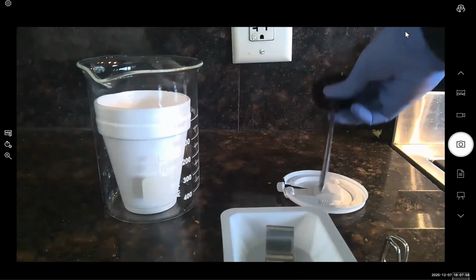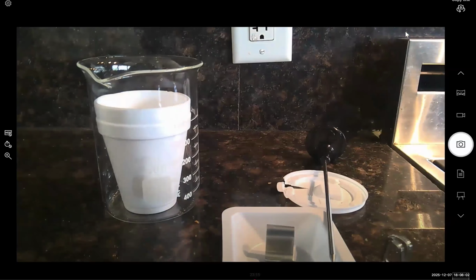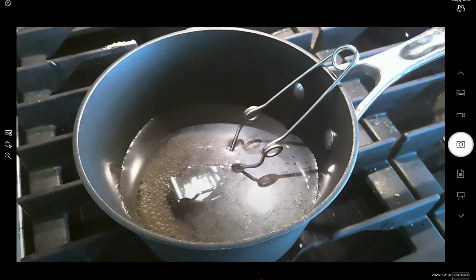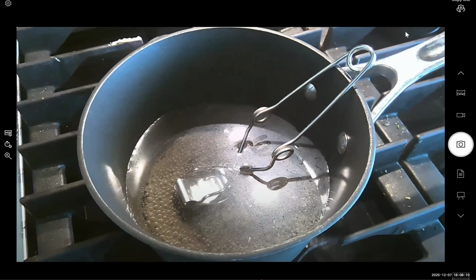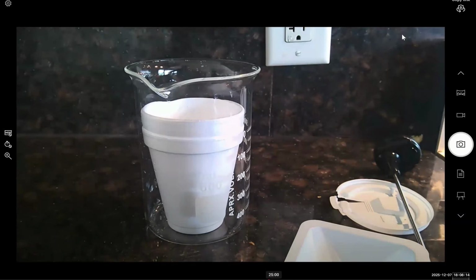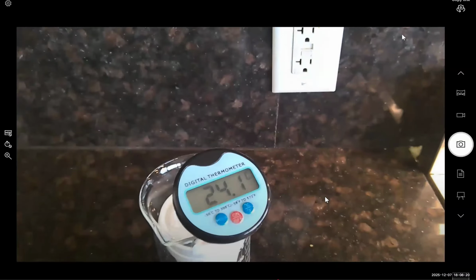Okay, so we have the metal piece. We're going to add the metal piece to the boiling water bath, and we're going to let it heat for about 10 to 15 minutes. In the meantime, we're setting up our coffee cup calorimeter.